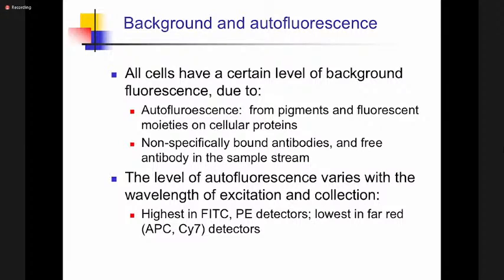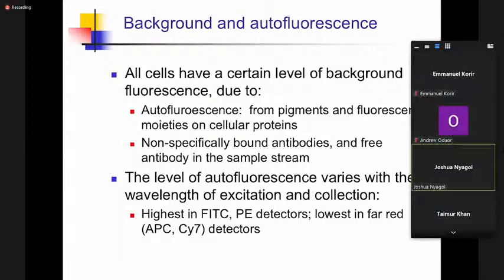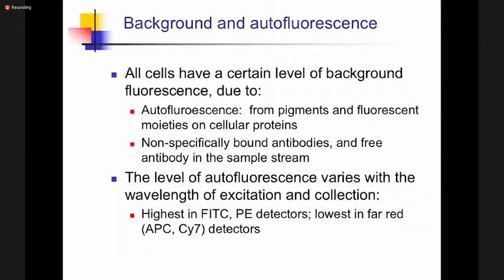You must be sure that for every technique, even as you're doing hematoxylin staining, or maybe the immunohistochemistry technique, or even the PCR technique, there must be some element of background interference. And this background interference can come from the autofluorescence of your cells. The cells can also autofluoresce. Therefore, there must be a correction measure instituted to ensure that this autofluorescence is not giving you wrong results, on which you might sign out or institute management of the patient. So the background noise, we call it noise, must be limited.